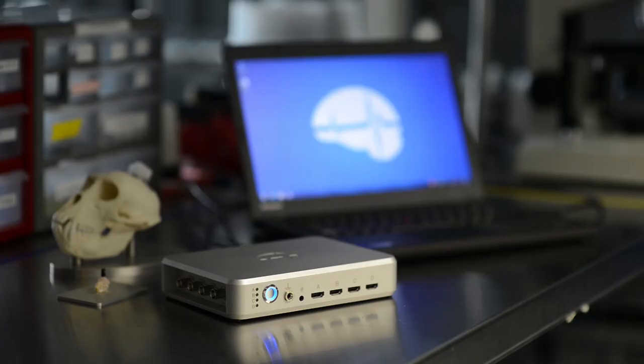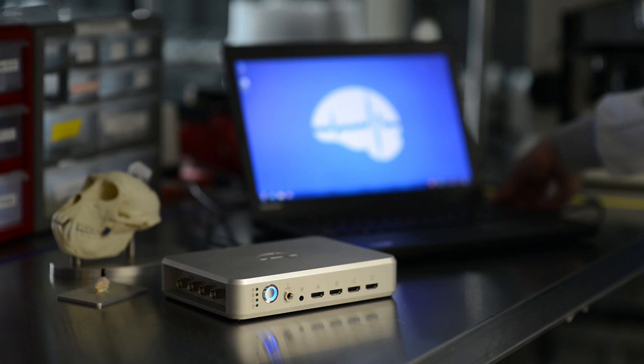The SmartBox arrives ready-to-go with minimal setup required. It is fully validated and supported by Neuronexus.